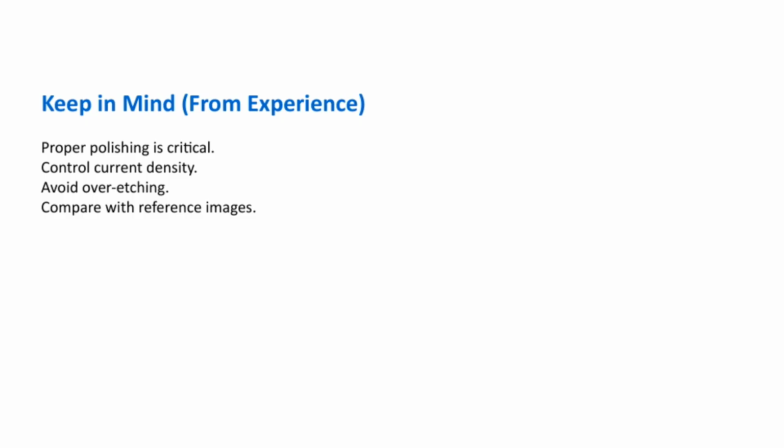To ensure we're on the right track, always compare your work with reference images. We use these as benchmarks to guide adjustments. These points all tie back to the overall goal of maintaining quality and consistency throughout the process.